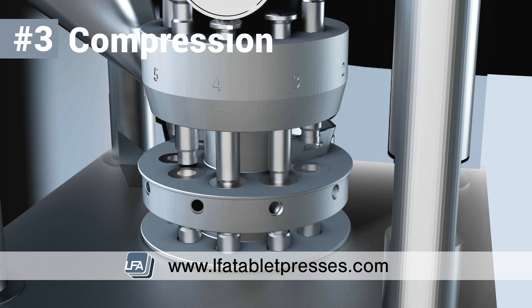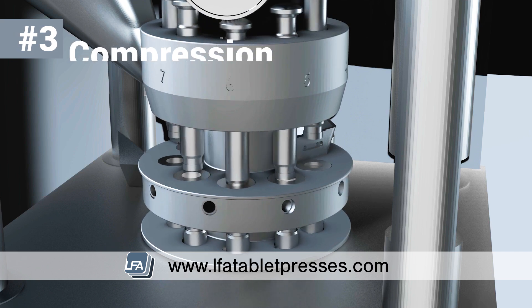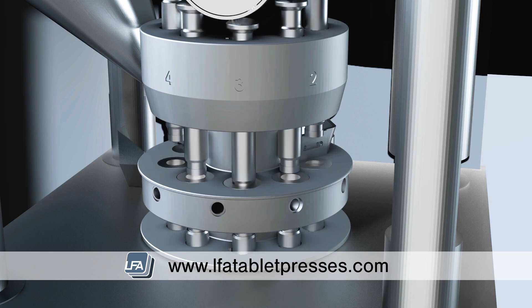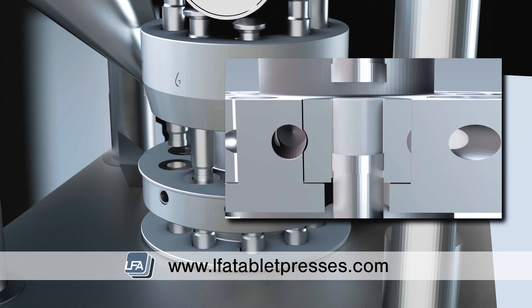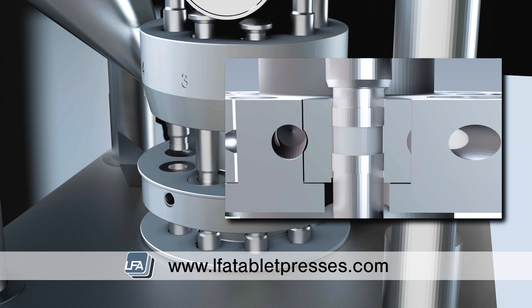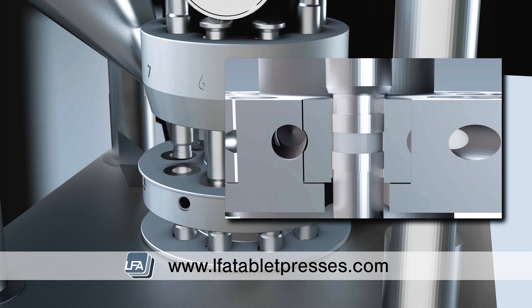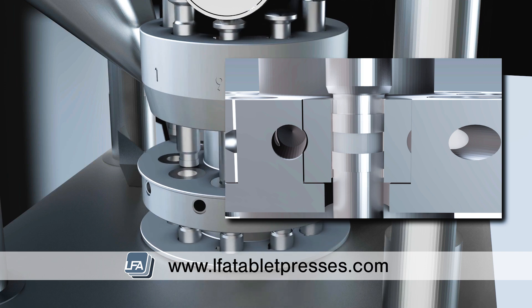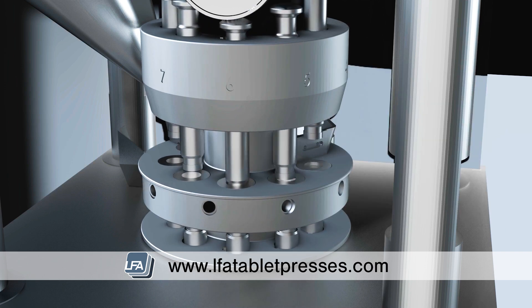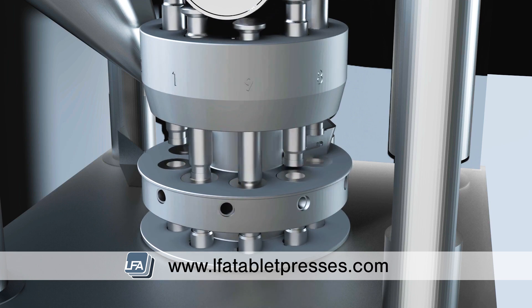Compression. The punches now move around to the compression stage, where both the upper and lower punches are brought together under high pressure to form a tablet. Both the upper and lower punches move between two compression rollers which bring them together and compress the powder. Pressure is adjusted by the technician, which will determine your tablet's thickness and hardness. If the punches are brought closer together the tablet will be harder and thinner; if they're further apart the tablet will be thicker and softer.